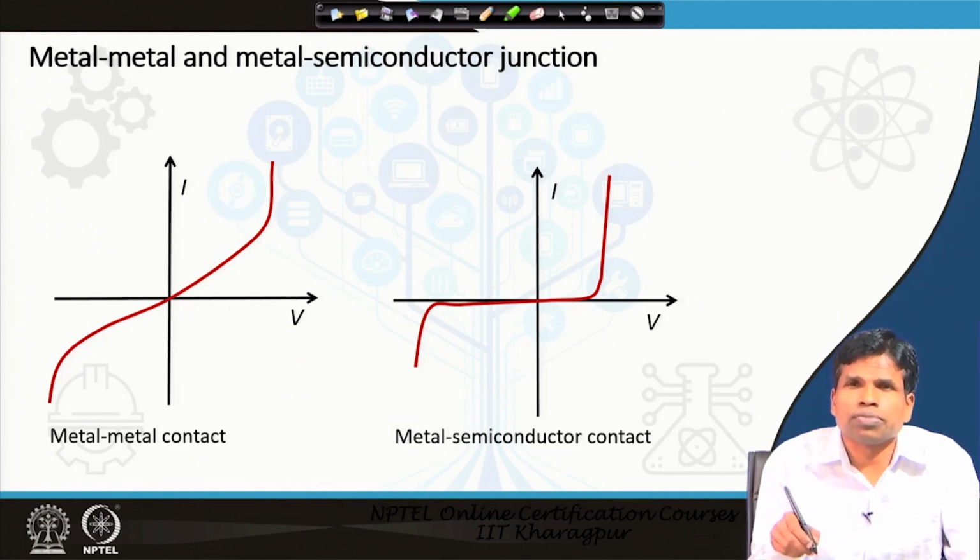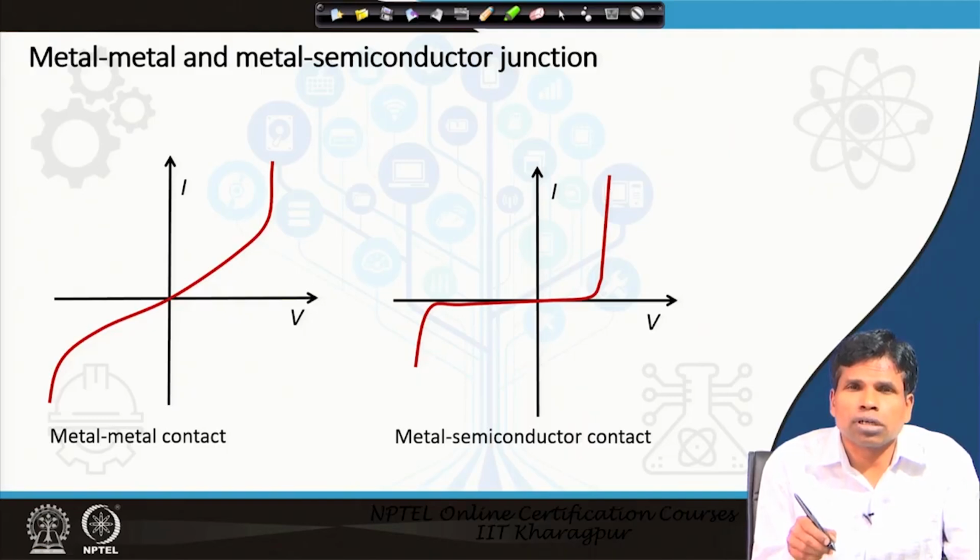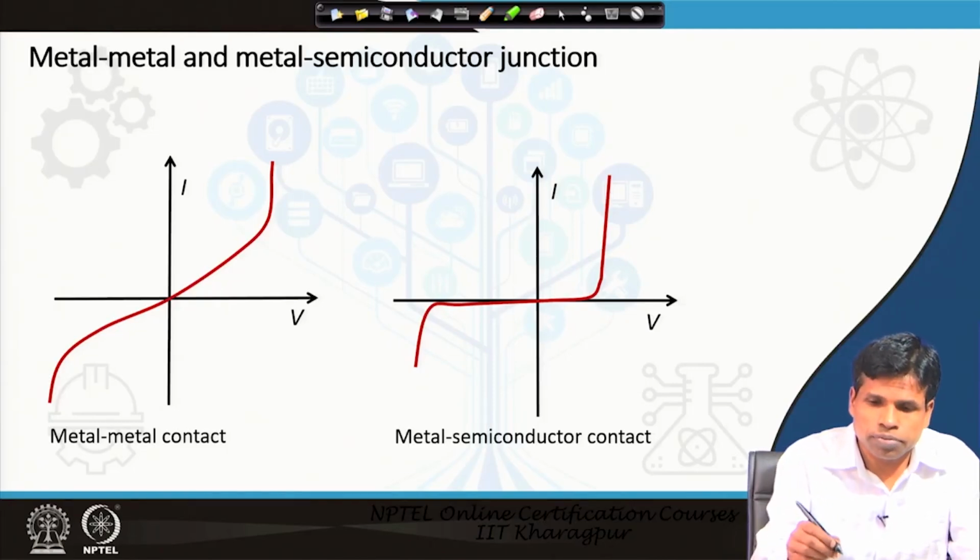So, you get information about the single atom only, a very local region, not the average or whole-area information. In order to get the whole-area information, you have to measure at multiple places to get an idea, but even doing multiple places is not sufficient to know what is happening throughout the region. But in the case of nanomaterials, or for getting information about a specific site, specific position, scanning tunneling microscopy is most suitable.